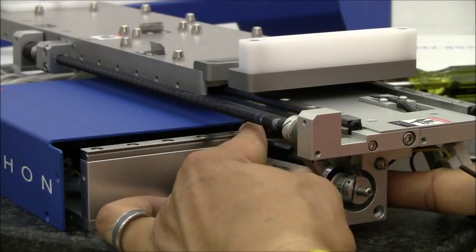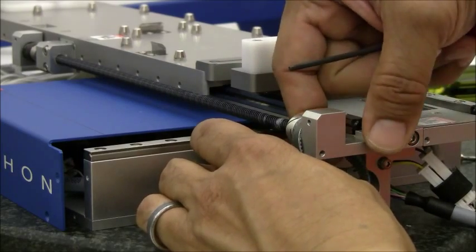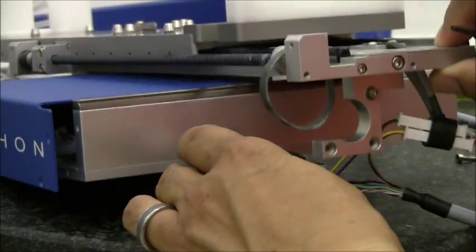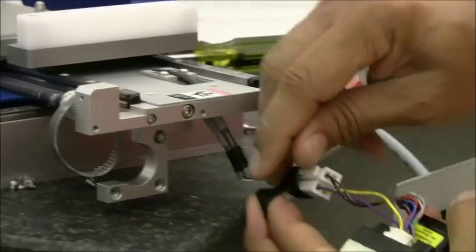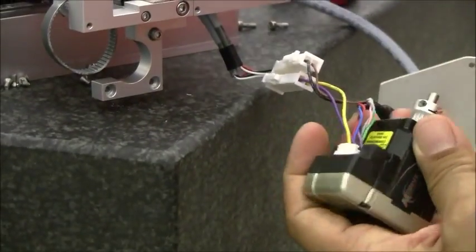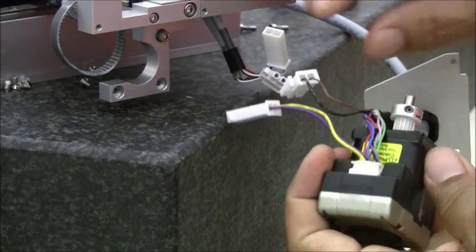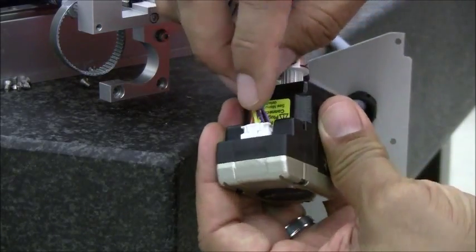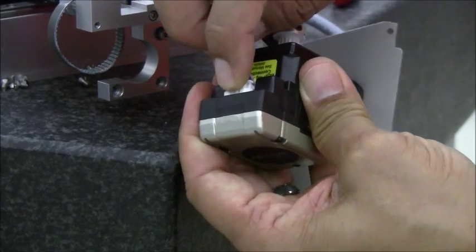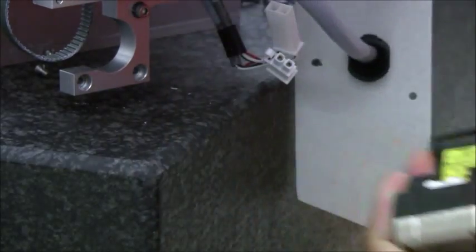At this point, you will be able to pivot the motor out of the pulley belt. The three wire connections will be exposed. The connection to the motor has a little clip that must be pressed and then the connector will come out.